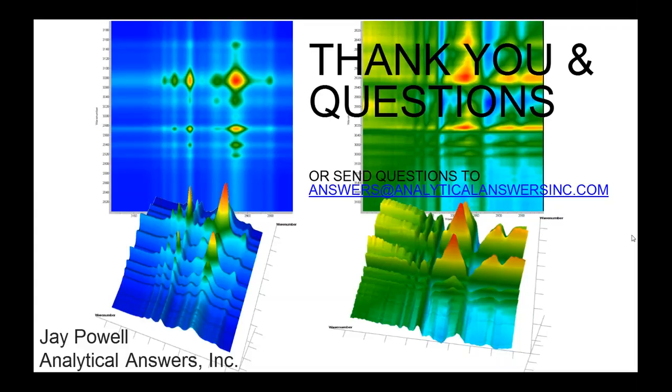Again, I'm not sure I'm able to give you an explicit answer. It depends a lot on your adhesive, how thin or thick, and the substrate, and what compound or compounds we're looking to characterize migration of through the adhesive. We're certainly willing to discuss that question. The exact technique we would use would be dependent very much upon what the adhesive is, what the substrate is, and what the species of interest are that are migrating.